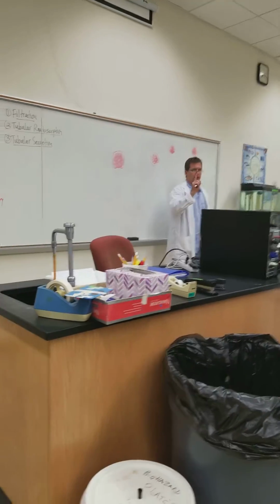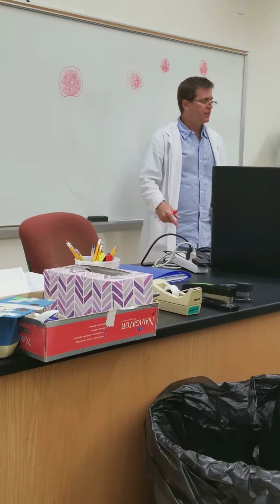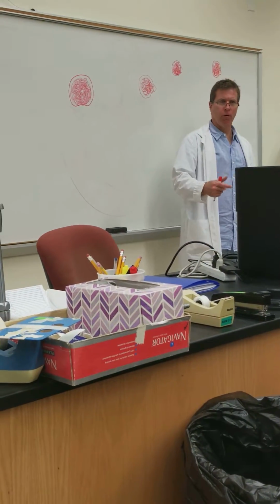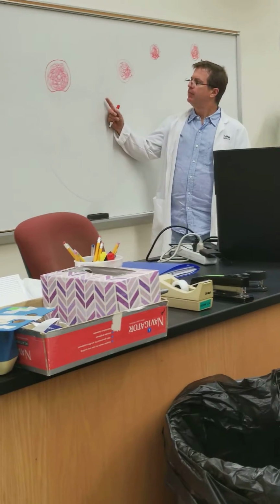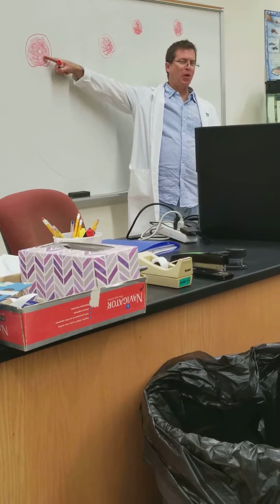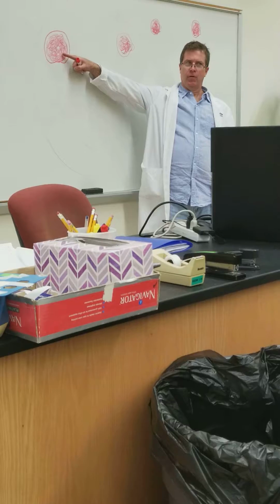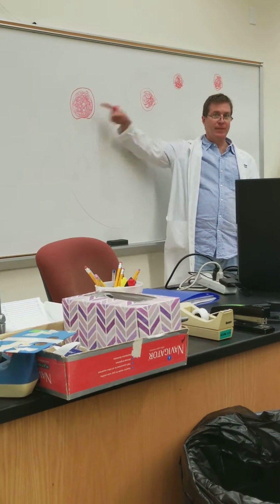So, next week on test day, from what organ is this tissue? Kidney. Thank you. What region of that organ are we looking at? Cortex. Thank you. Name the structure at the pointer. Glomerulus. Okay? List its function. Filtration. Thank you.